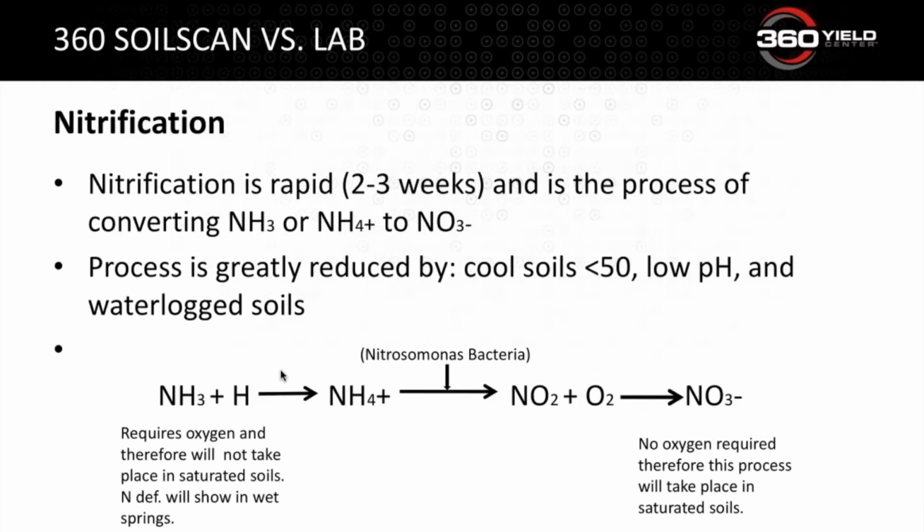And that's what you'll send to a lab and say, hey, I want to test for these products, and that's what you'll pick up. But keep in mind, as we warm those soils up and those samples have ammonium in them, we can convert some of that ammonium into nitrate during the handling process. And so I just want to share a little bit about what we've found.